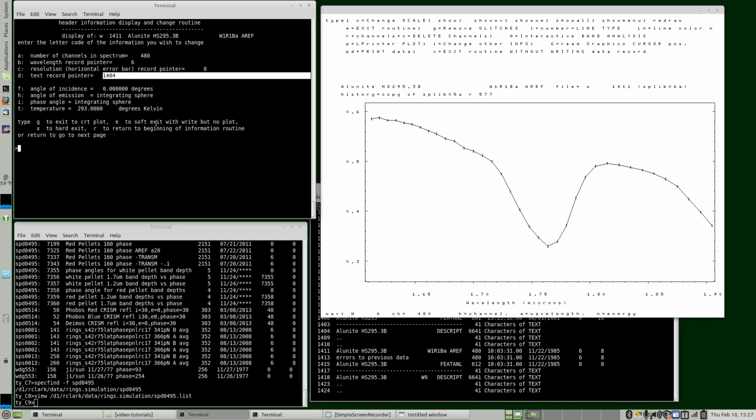So all of those are part of the record for each spectrum. These can be changed, but in order to change them, you need to read the spectrum in, change it, and write it back out. And we only selected display, not to write out the results. So any change we did here would not have any effect on the data in the file.